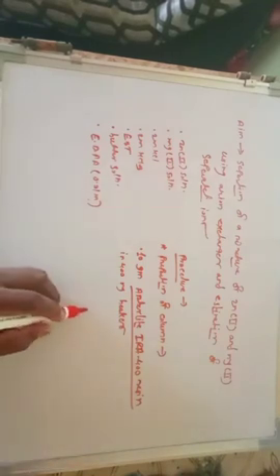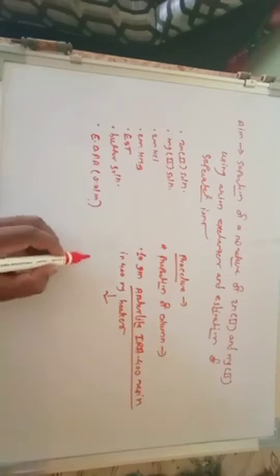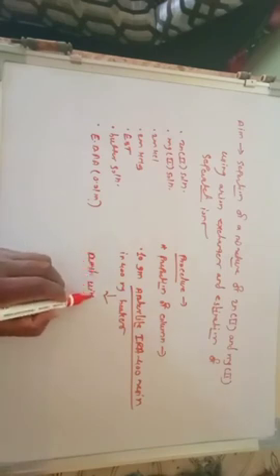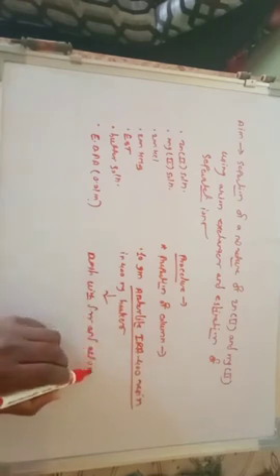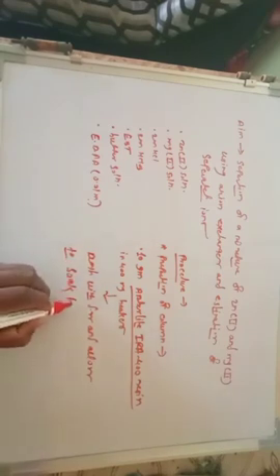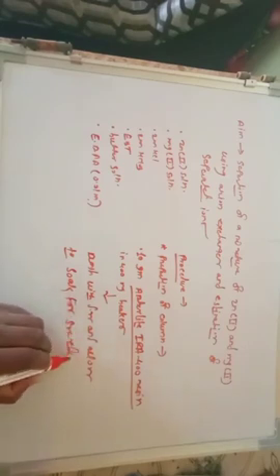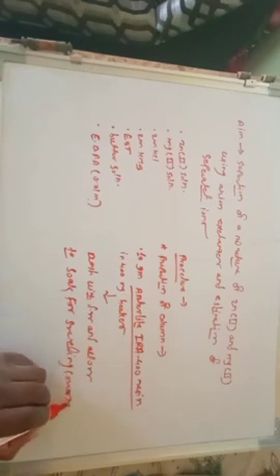Then wash it with distilled water and allow it to soak for swelling, to increase the particle size, overnight.